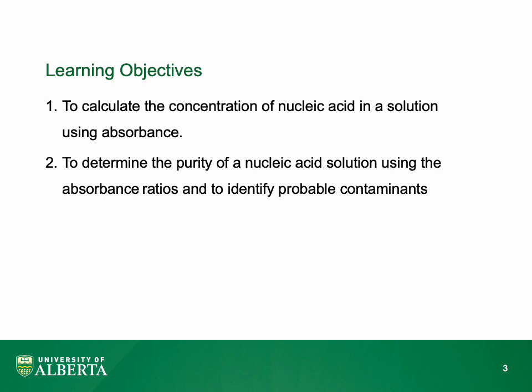By the end of this presentation, the learner should be able to calculate the concentration of nucleic acid in a solution using absorbance. The learner should also be able to determine the purity of a nucleic acid solution using absorbance ratios and identify probable contaminants.